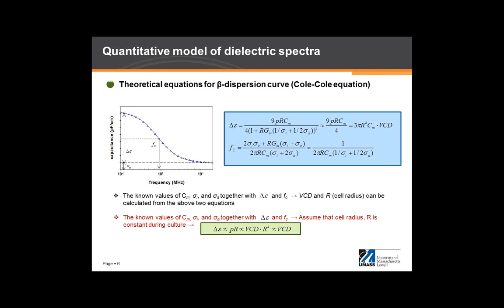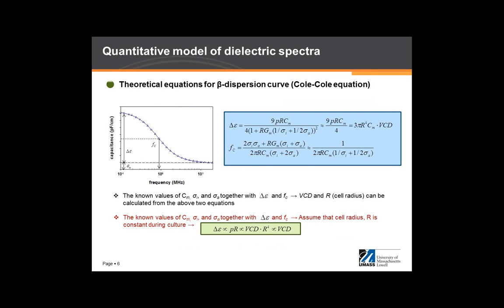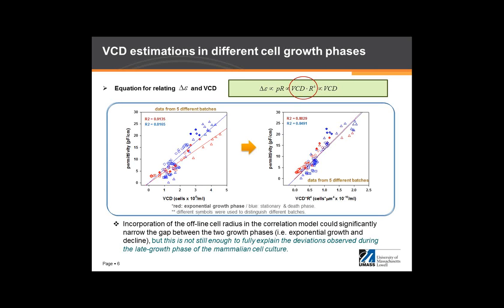However, there is quite a significant amount of deviation during the declining phase and after the plateau period. So first of all, we were wondering why this is happening. We first checked the radius. Based on the value measured by this technology, we monitored the radius calculation based on this equation and the capacitance measurement. And we found one thing very interesting.